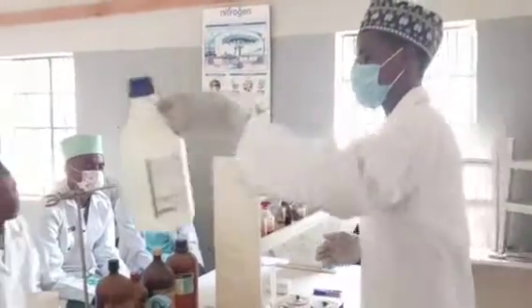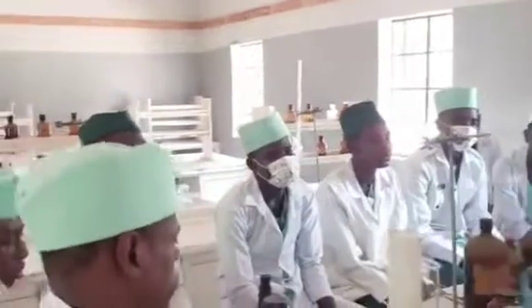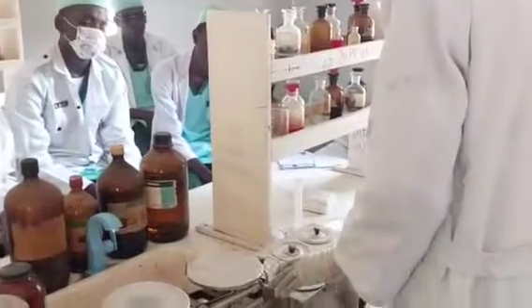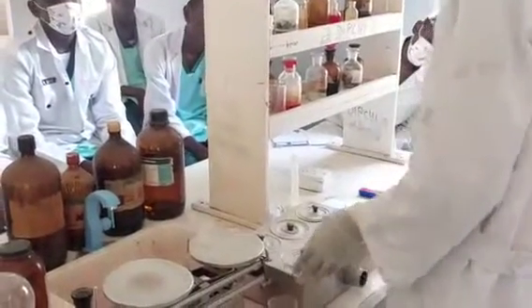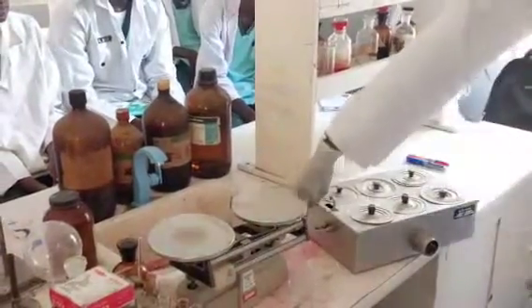So once you see flammable, you cannot use an open flame. That is why we have what we call the water bath. This is the inlet where water will be introduced.